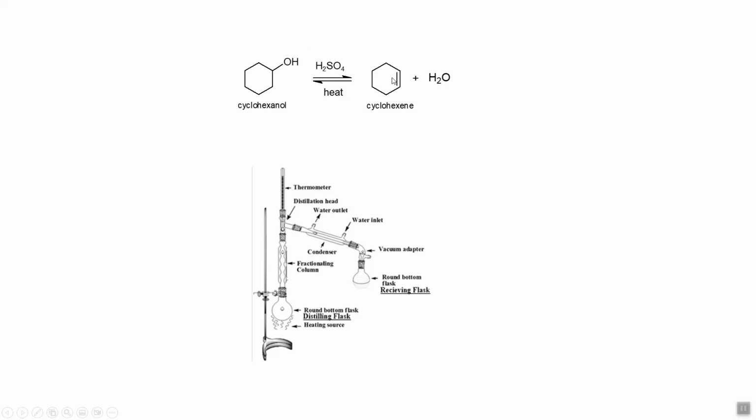The cyclohexene should be showing up first because it has a lower boiling point than the cyclohexanol, but you're going to see if you have 1 or 2 peaks. Katie will have a standard available for you on the outside of the GC, so you'll be able to see the retention times of your product and of the cyclohexanol, and be able to know which you have.